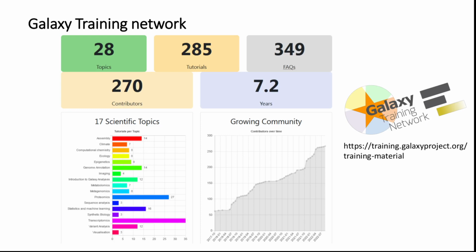There's also the Galaxy Training Network, currently covering 28 different research fields with more than 285 tutorials, and the availability of trainings is growing over time.